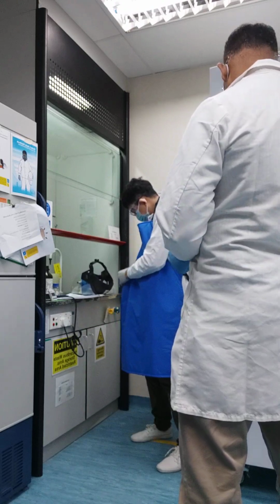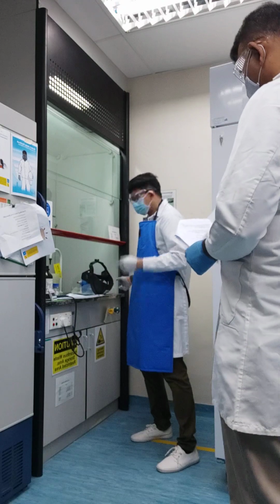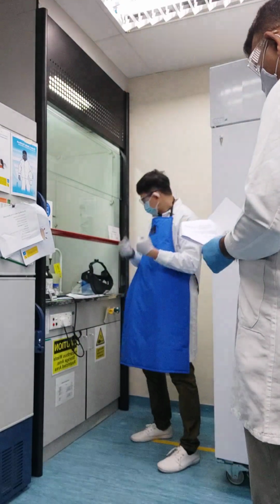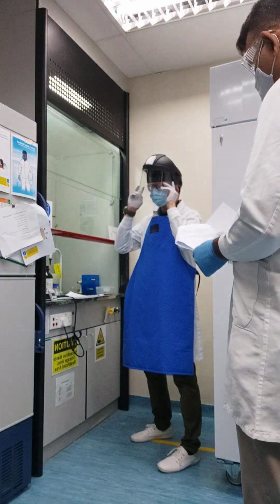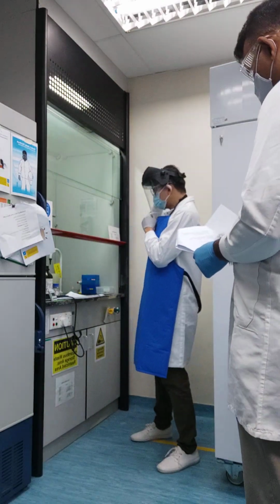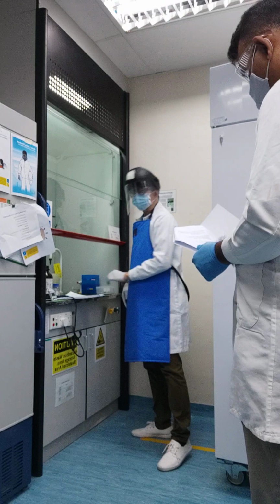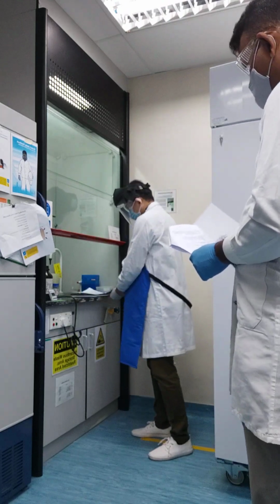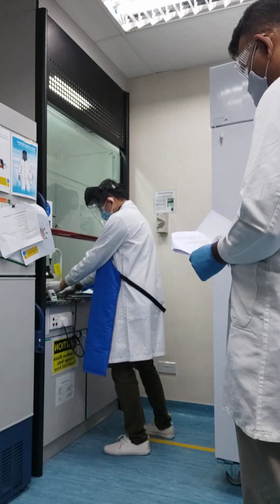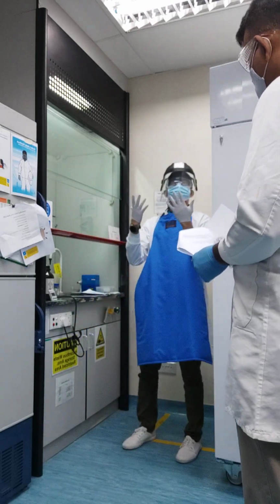Secure my apron. The face mask, the glove. So I need the face shield. And I'm at step 4. So now I can start my experiment. Am I right? Chandra, can you check for me?